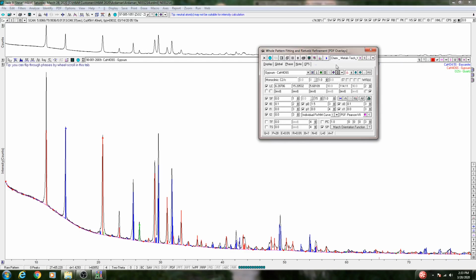The first thing you want to do in a Rietveld refinement is choose a good starting point. Remember, this is a minimization process. You're trying to find a global minima. The closer you are to that minima before you get there, the less likelihood there is of falling into a false minimum. So you want to check how close you are based on the initial position of our sticks.